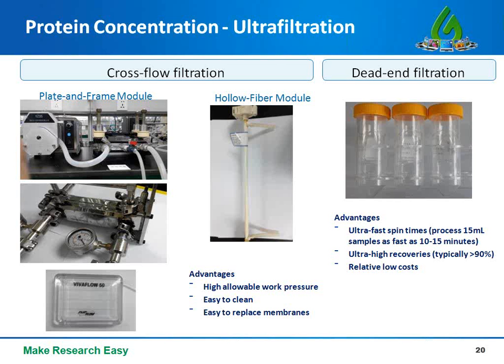If you work with small volume, dead-end filtration is the convenient way. It can process 15 ml samples in as little as 10 minutes. The recovery rate is high too, typically over 90%, with relatively low cost.